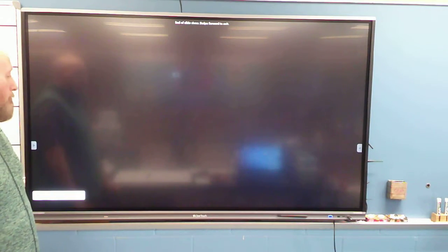All right? So, again, that was just an example of some of them. Now, we'll go and look some more when we get up here later, but I hope this kind of helps you go through that. And I'm going to send you some other stuff a little bit later today to look at. But again, just be aware of what you need to start looking at. If you want to go on YouTube, or not YouTube, well, you can go on YouTube as well, but go on a search engine and go look for each individual images of each different type. Type in each one of them, get a good look at each individual one of them, make sure they're what they say they are, and then go through them one at a time and look at them, and you'll start to see the patterns. There's always a pattern that'll help you figure out which one of those 4 types of tissue that you're looking at, okay?